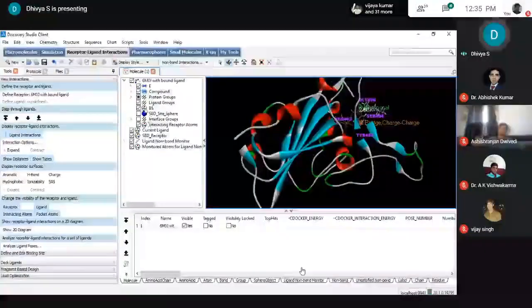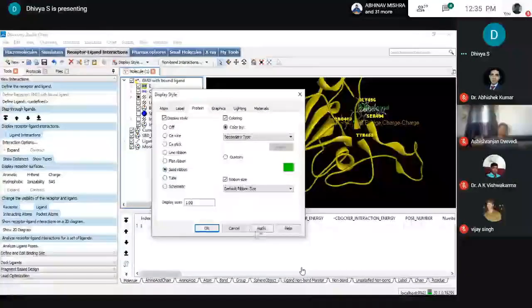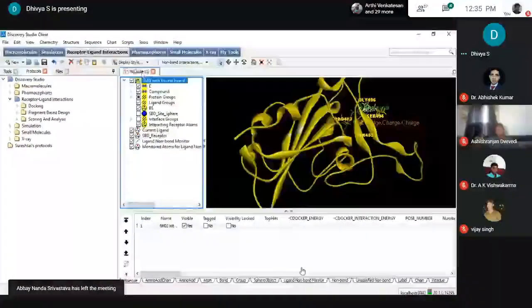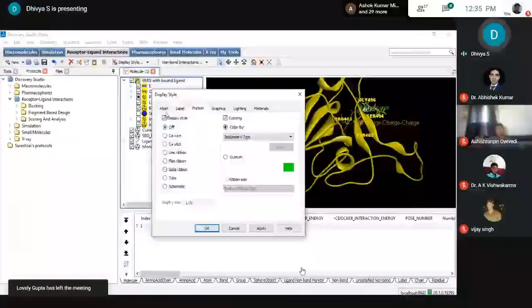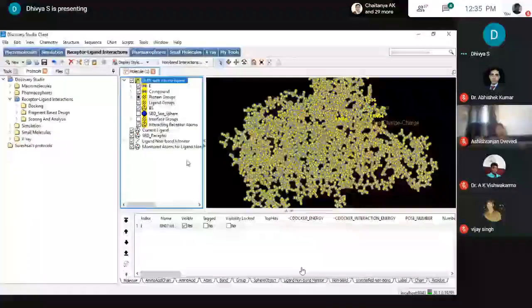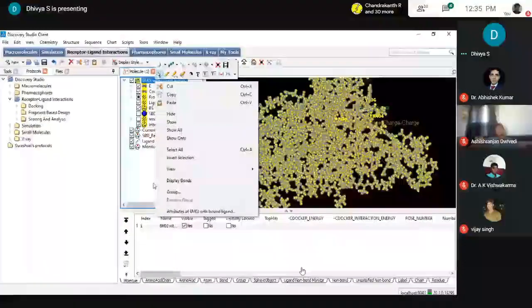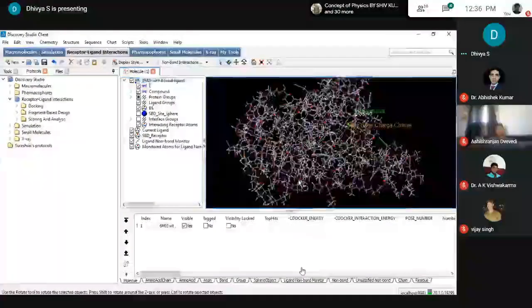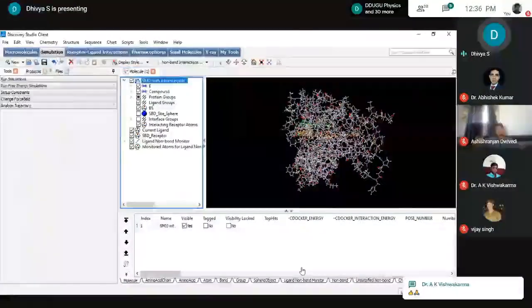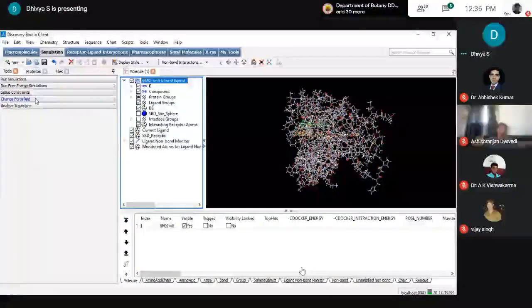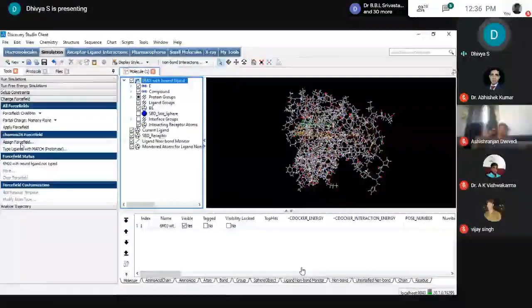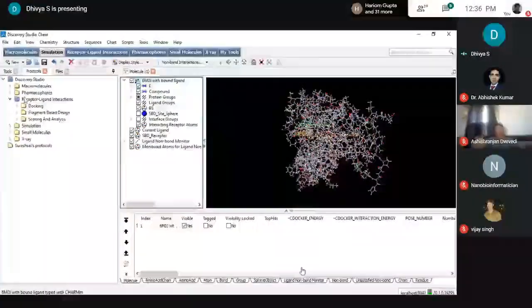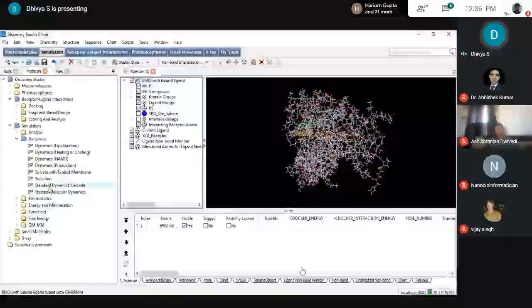The molecular dynamics simulation will help identify the stability of the system — whether the molecule is constantly interacting with the active site or not — and RMSD analysis. To set up dynamics, first apply the CHARMM force field. Then go to Protocol, Simulation, Dynamics and Simulation Cascade, Standard Dynamics Cascade. Input your receptor, choose algorithms, set minimization steps (I am limiting to 100), set the steepest descent gradient to 100, then configure heating steps, equilibration, and production steps.